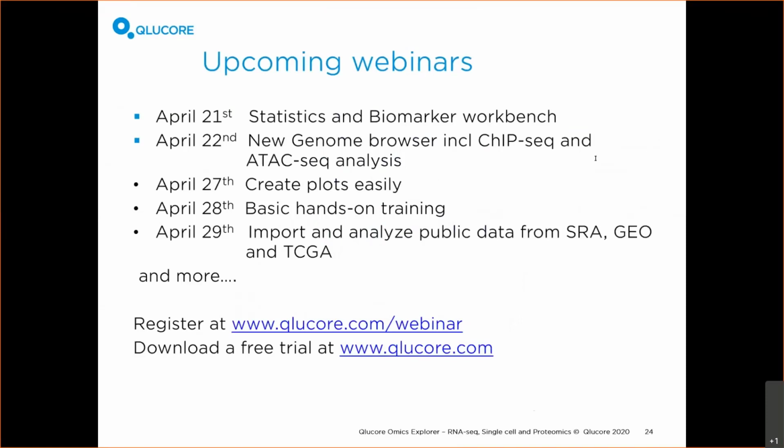How about just click opt when doing the filter by standard deviation? Yeah, you can try that, but it might not work so well with the single cell data actually. But you can definitely try it. But there is very little variation on each of the axes when you have so many samples. So it might not give you a good result, but it's definitely a thing to test.